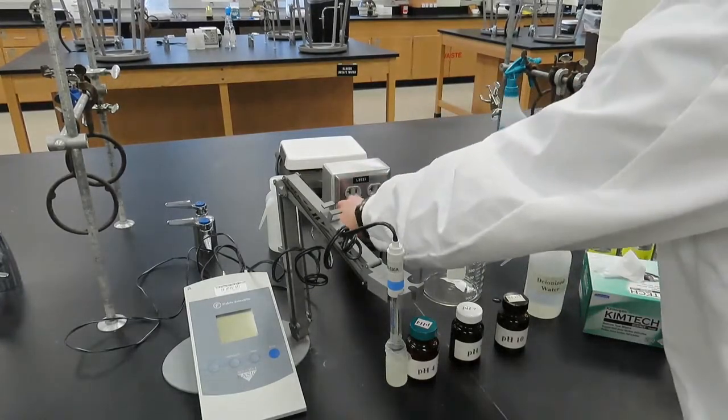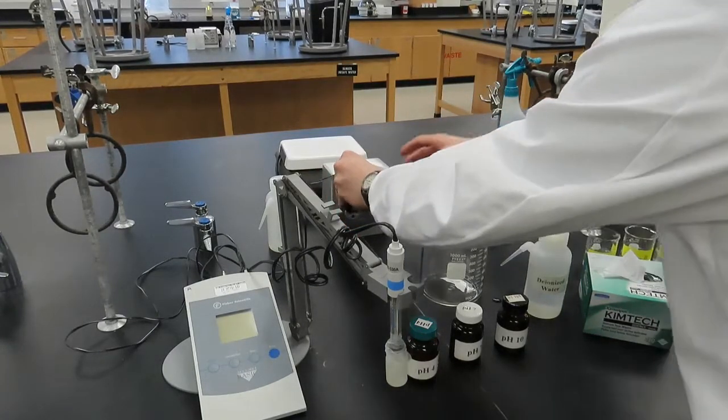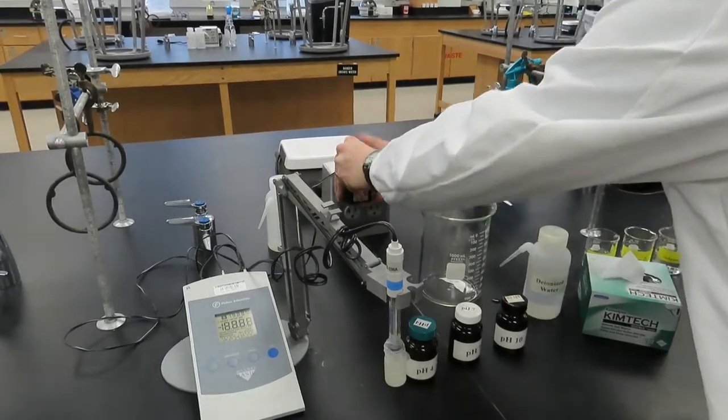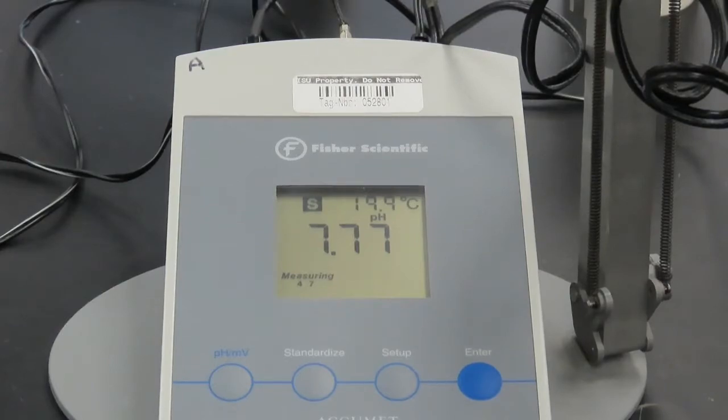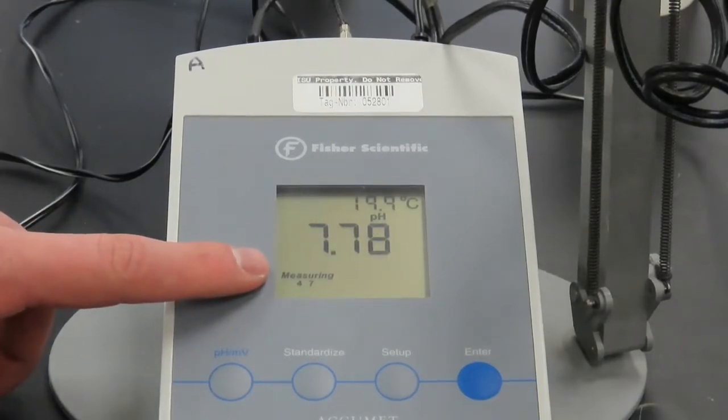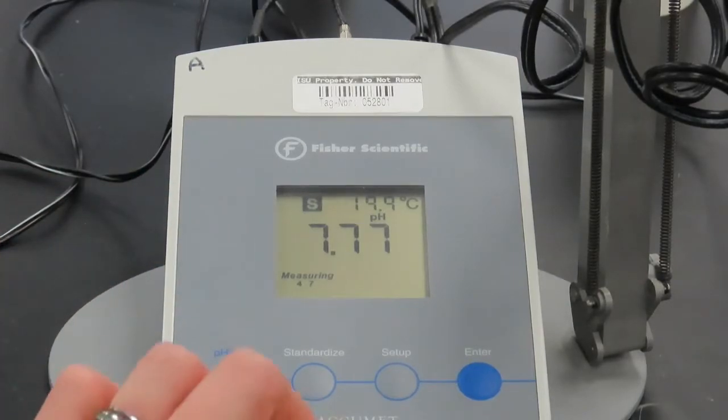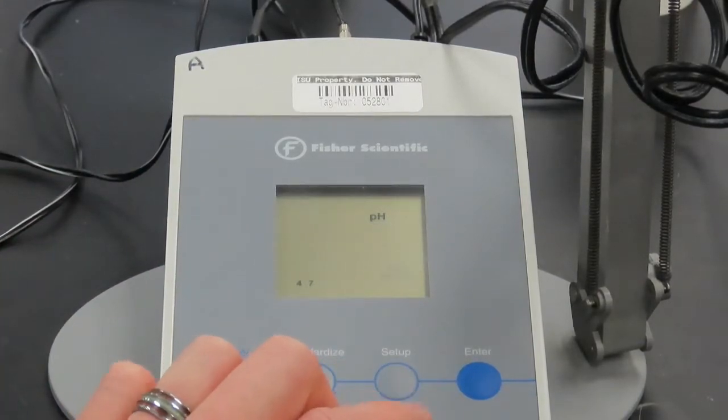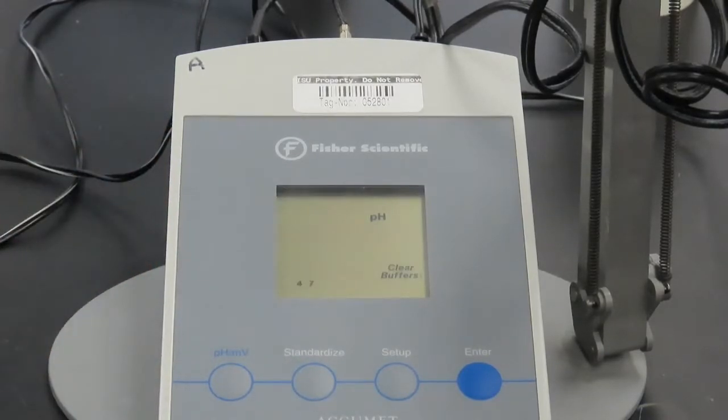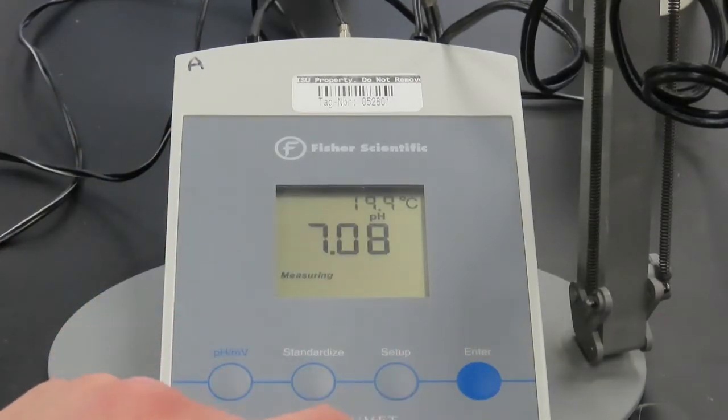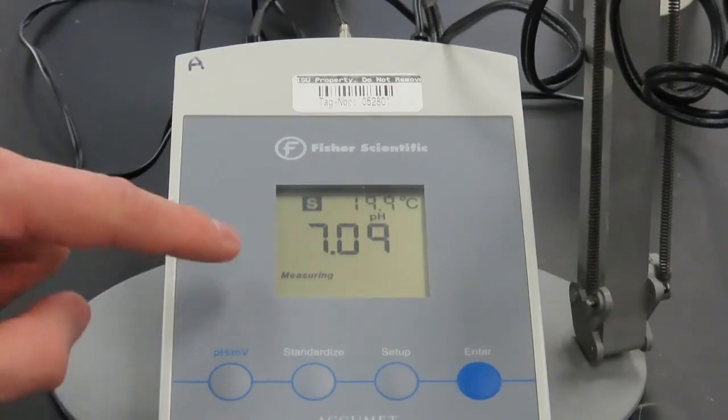To begin, we'll first plug in the pH meter. When first turned on, the lower left corner of the display usually shows a couple of numbers, 4 and 7 in this case. These are the pH values of the buffers that were last used to calibrate this instrument. A calibration is no longer valid. We will first clear the buffers by pressing the setup button and then the enter button. The pH meter is now ready to be calibrated.